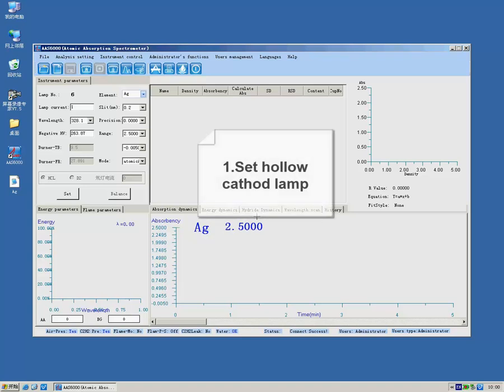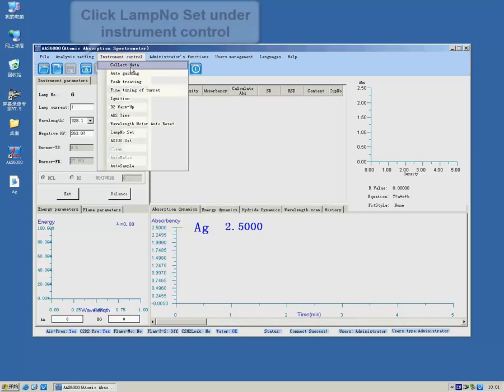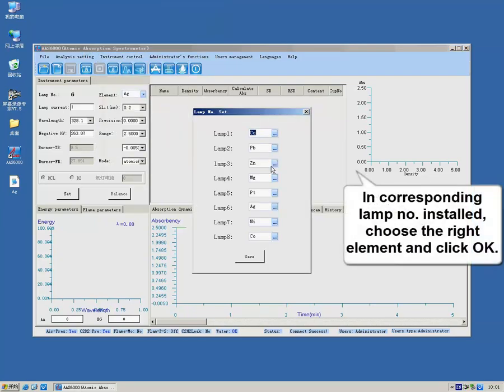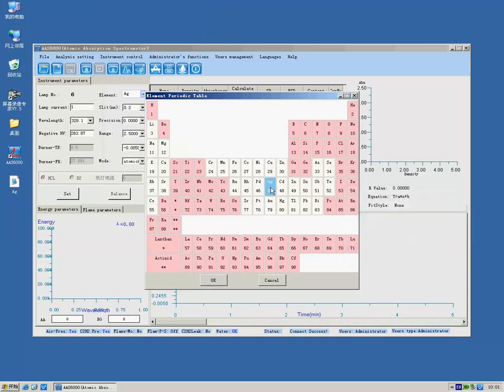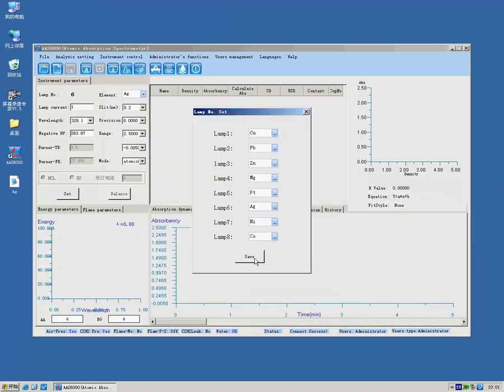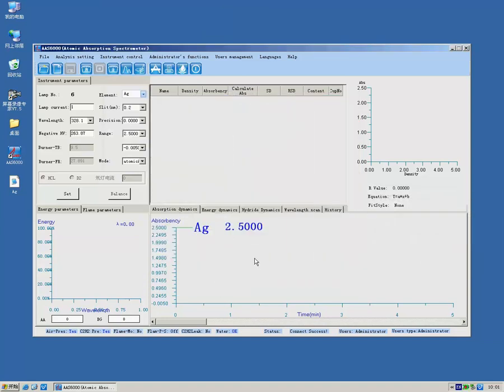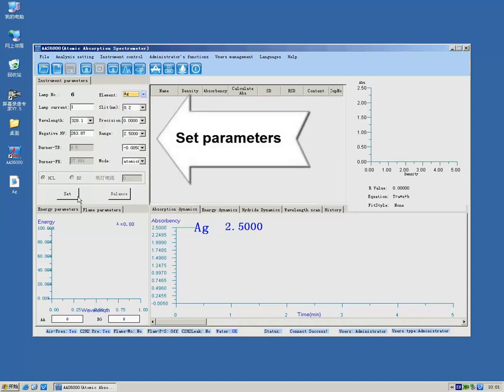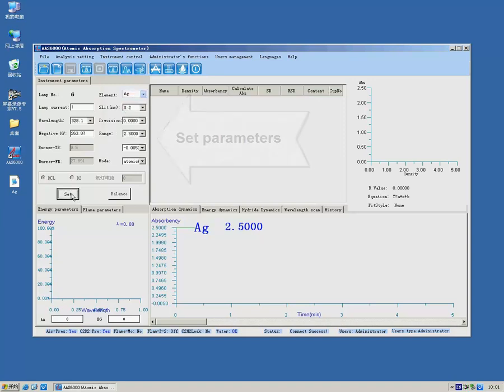First, set the hollow cathode lamp. Click lamp number set under instrument control. Choose the corresponding lamp number and element. Set parameters. When setting is completed, confirmation will be shown in the status bar.